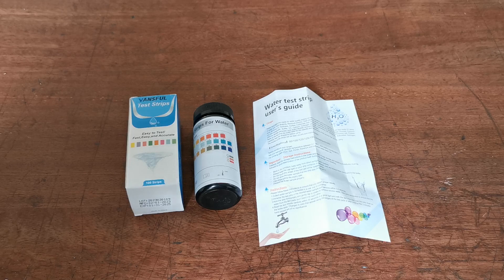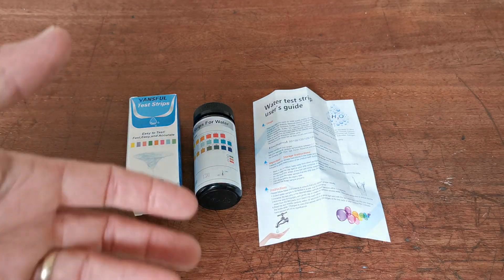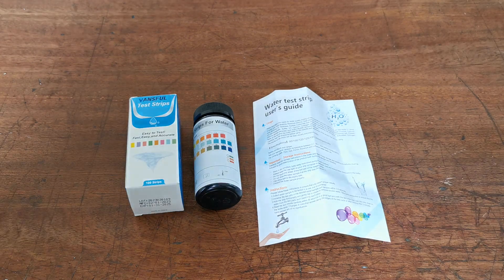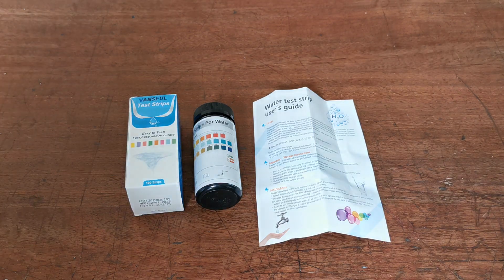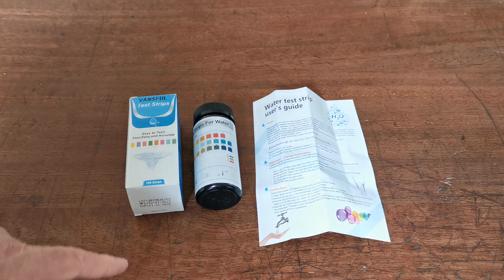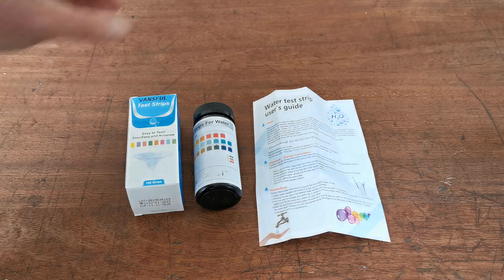We've found that as long as you keep them dry, they will go on working for a very long period of time. The manufacturer, to protect themselves — as with all dip tests — will recommend use within three months of the seal being broken. That's just because they know human nature is not to look after them well and allow them to get moist. But if you do look after them, expect a much longer life from the 100 test strips. I've been using a pack that's been open for about two years and they're still giving real accurate tests — so a good guide for you there.